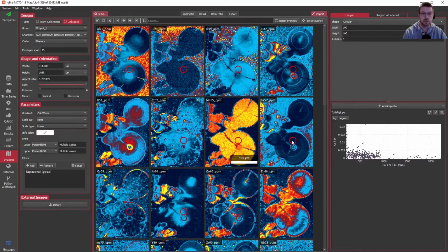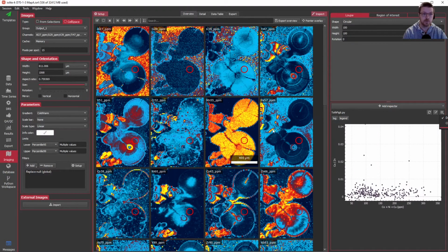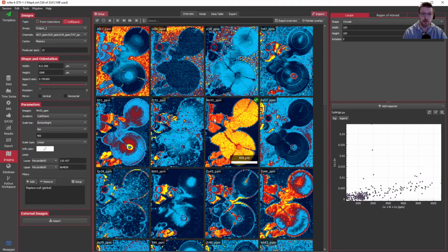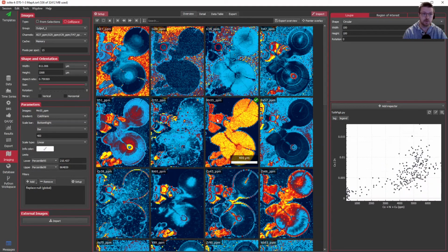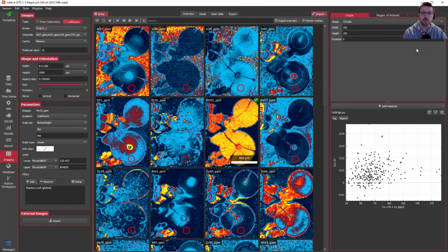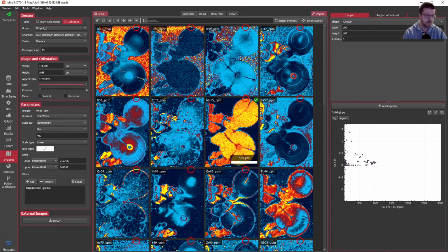So already this is working. Right now, the way that we have it set up, it's plotting each individual time slice that contributes to this region of interest. So you can see what it's doing there as you mouse over the image. You can see that there's a bit of a linear trend in this bit of growth here, and it's quite different there. So we could change this.